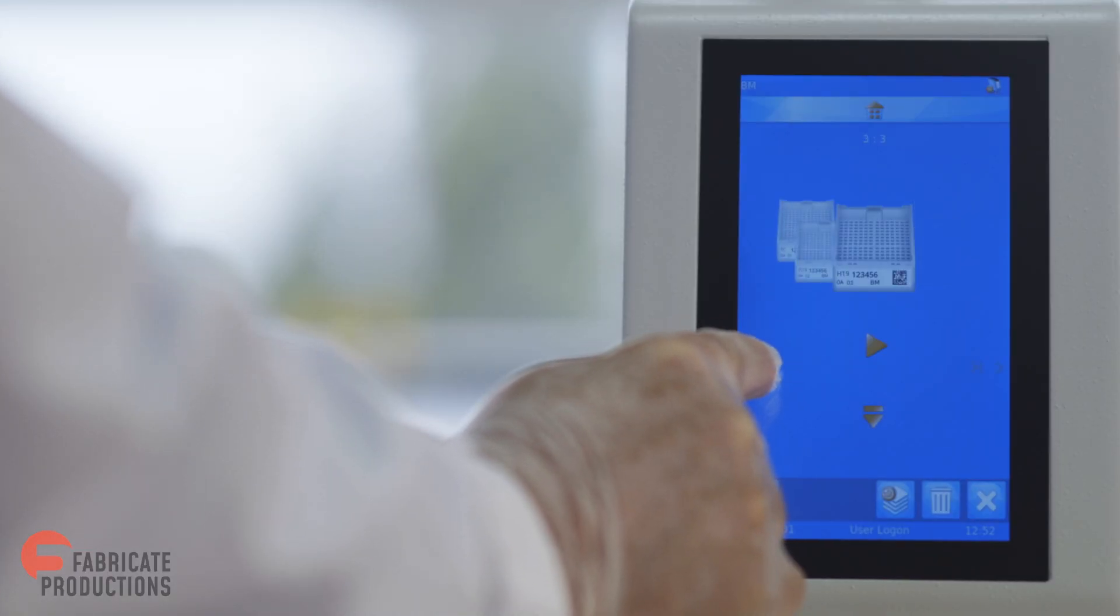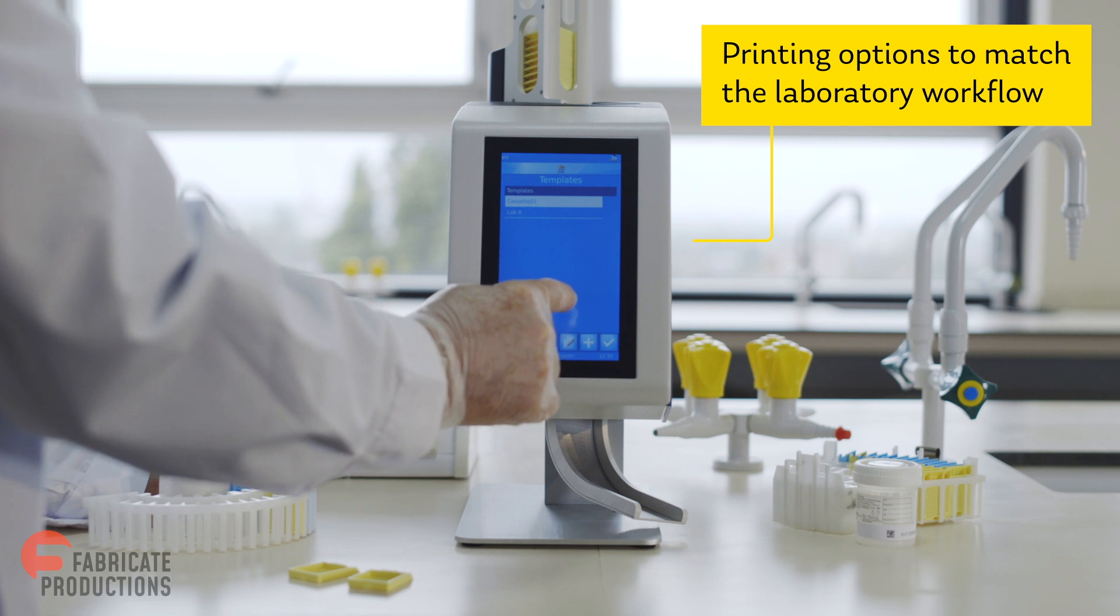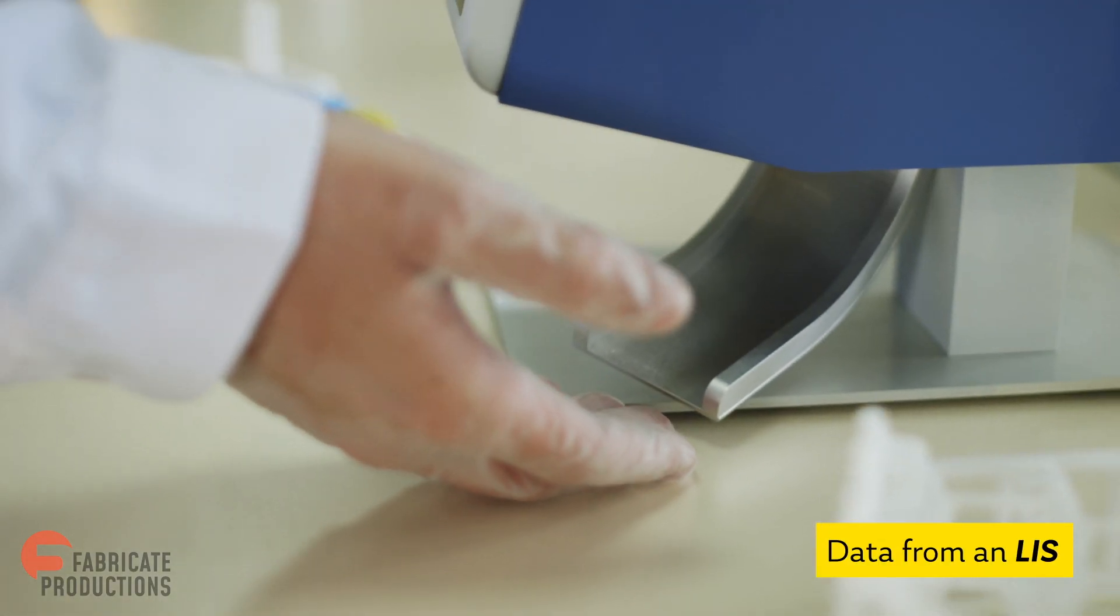The printer can be driven in a number of different ways to give you control and flexibility. A cassette can be printed automatically on receipt of data from an LIS.